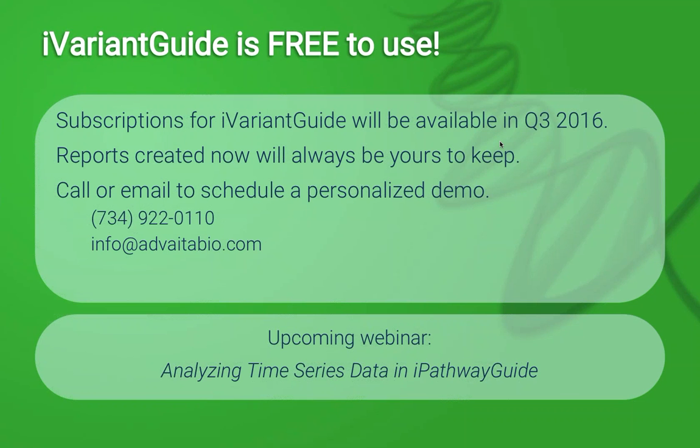The second part of the question is, is there a possibility to have this software run locally, as opposed to cloud-based? Currently our implementation is cloud-based so that we can take advantage of sharing and access. I do have a little bit of additional insight on that. Certain customers have asked if they could have it run in their own private instance in a cloud-based system. That is a possibility. If that's something you desperately need, please reach out to us. We would love to work with you on setting up something like that.